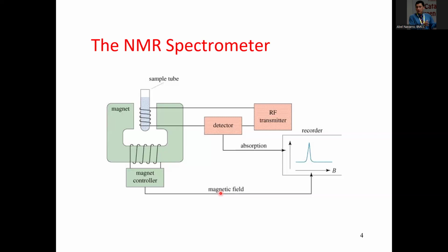I heard that they are now making 1600 megahertz instruments. For that one, you have to go to a second floor, because you have to put the sample in from the top of the magnet, while you are controlling from the bottom. So you have to go to another room, take the stairs, and put the sample in from the top.